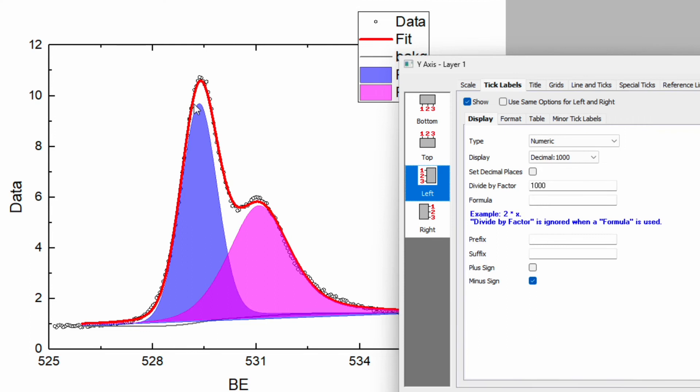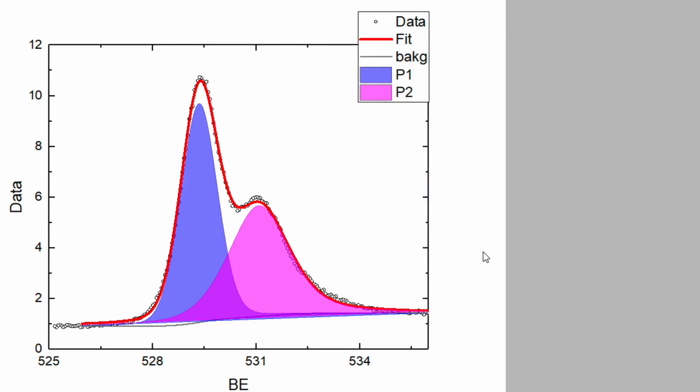Because it is intensity and we are just plotting one data, it doesn't matter even if you just write arbitrary unit, and then click OK.